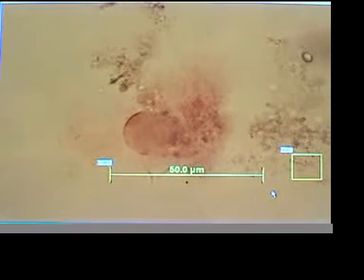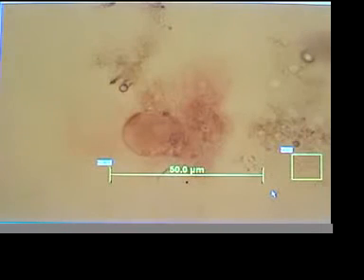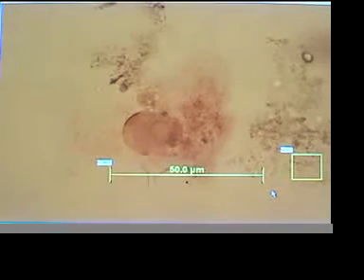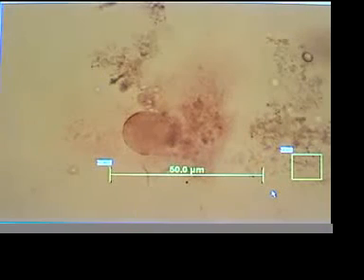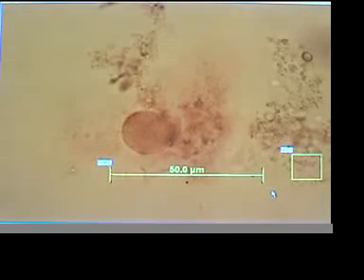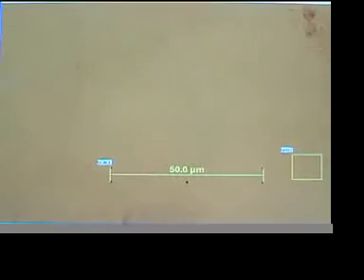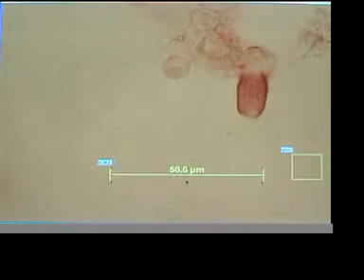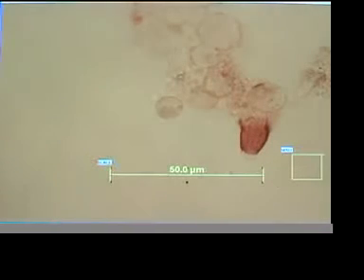I'm going to alter the focus just a little bit. A little sense of depth of field maybe. Very hard to see that remaining sphere. Okay, we have another one. We'll see if we can move fast enough and focus it. There it is, happening in your screen. This is in real time. Real-time dramatic devitalization. Look at that.